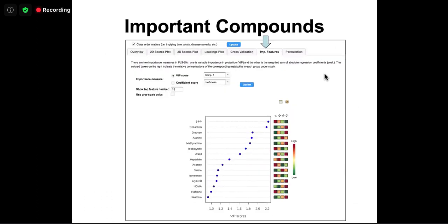So, the VIP score. The VIP score is well promoted by, I think, SIMCA or SIMCA-P. How VIP is defined has a good formula, based on the correlation coefficient. Most of the time you get something similar using either method. If you use some cutoff, for example 1.5 VIP score, you get seven of them, the top two.